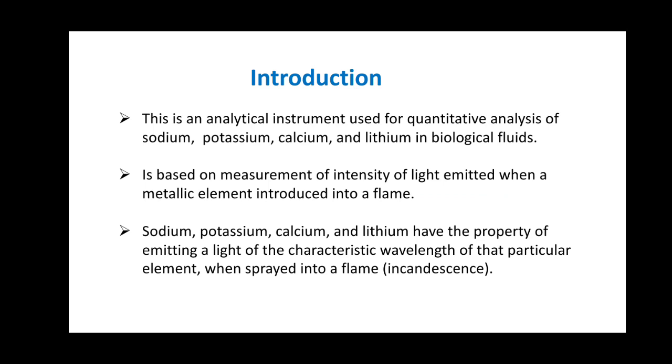It's based on measurement of intensity of light emitted when a metallic element is introduced into a flame. Sodium, potassium, calcium and lithium have the property of emitting light of characteristic wavelength. So based on their wavelength, these ions emit light of the particular element when sprayed into a flame.